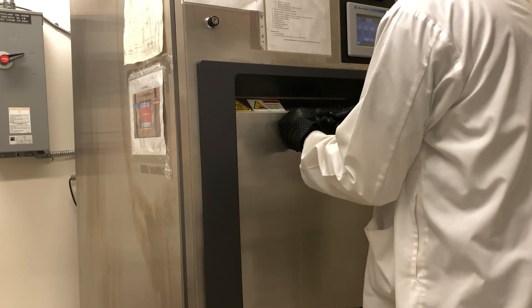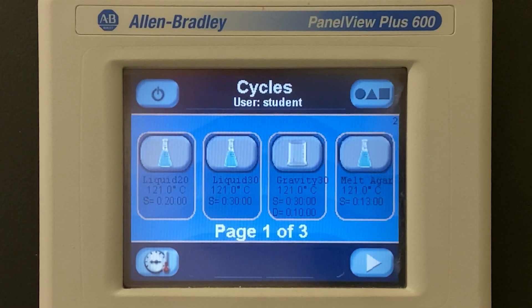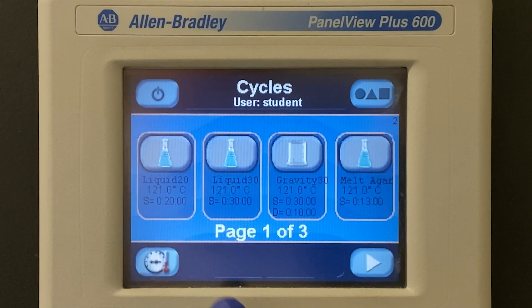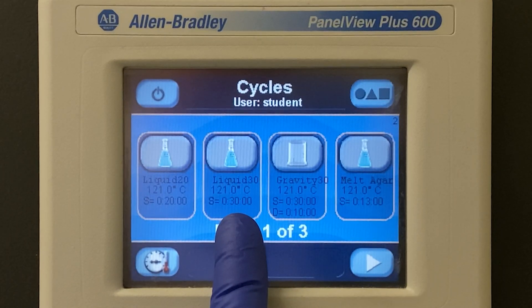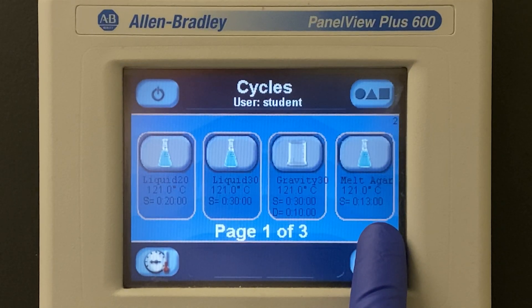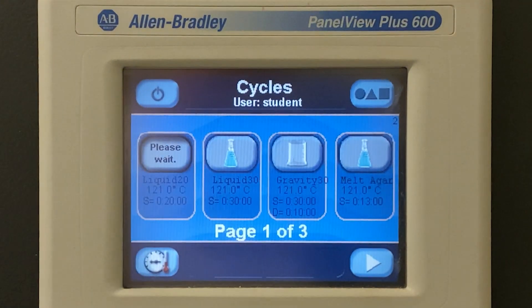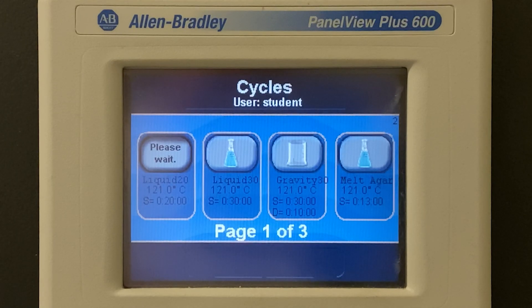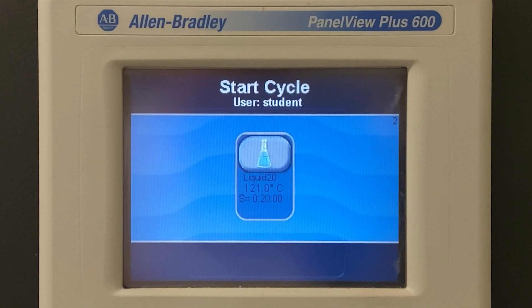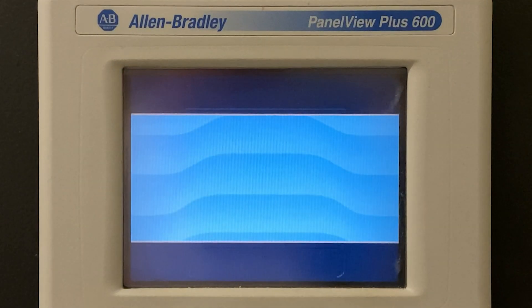Pro tip: push up on the door slightly. Many a time a cycle can fail because the door wasn't properly sealed. Here we have a touch screen. Liquid 20 is 20 minutes on a liquid cycle. Liquid 30 is 30 minutes. Gravity 30 is with a faster exhaust of the steam, and there's also melt agar. We're going to use Liquid 20 for this cycle. We press the button — it takes us to another screen showing that same cycle, Liquid 20. It's going to go to 121 degrees Celsius for 20 minutes. Press the button and the cycle begins.